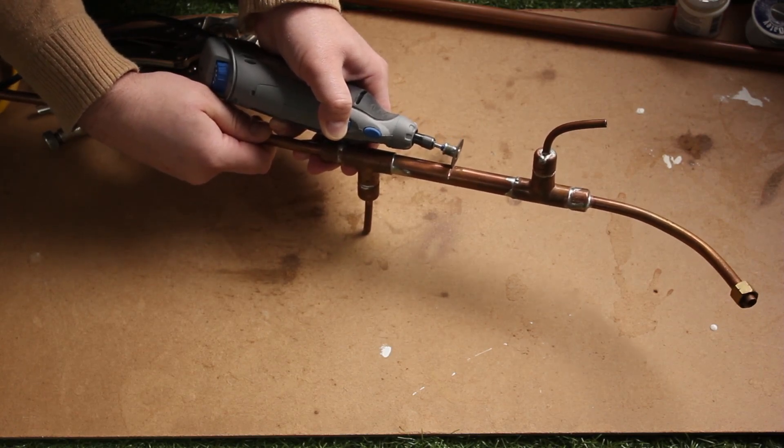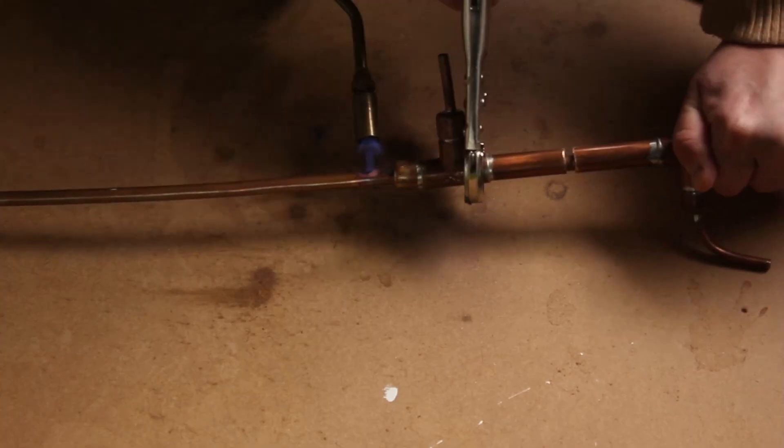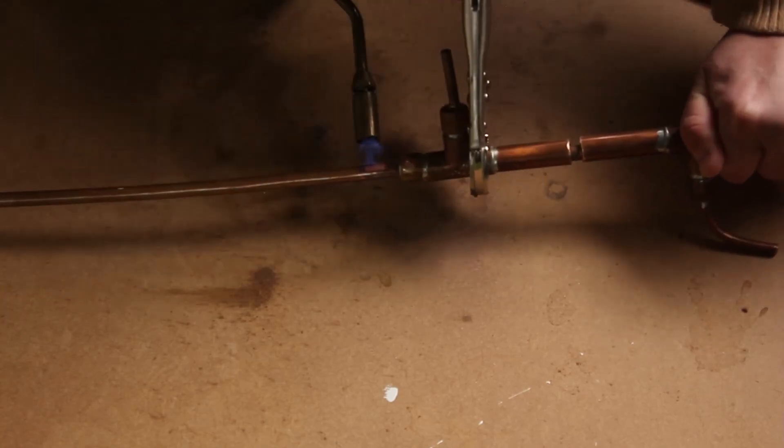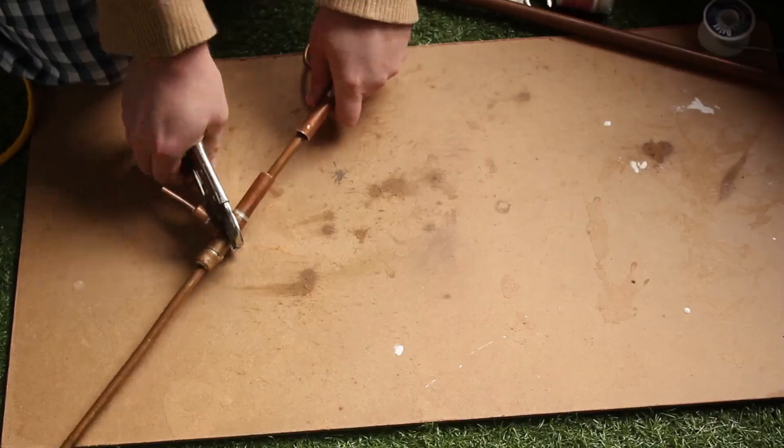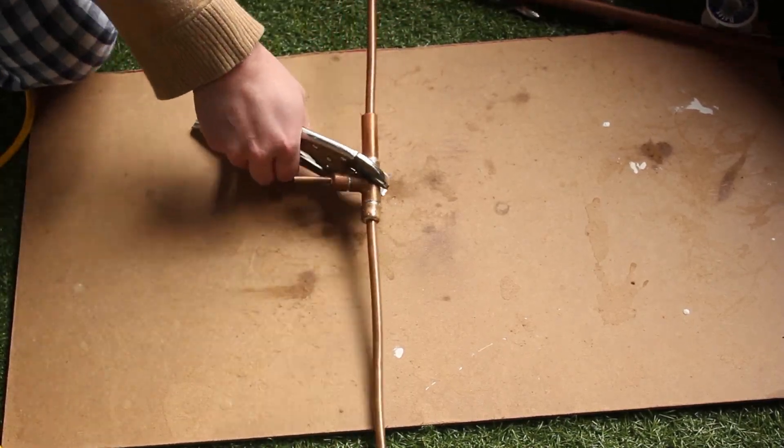My advice is to use a hacksaw and go very slowly and carefully. Once I applied some heat and got things moving, I was able to get the rest of this out without having to apply more heat to it.